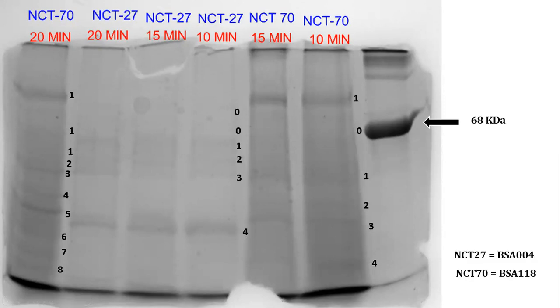See, till here, we know how many species we have. We do not know what species it is. Based on the characteristics that we have documented, we can compare it with Bergey's manual. We may end up diagnosing till family or genus level. It is quite possible. If necessary, we can also use selective media to find them.